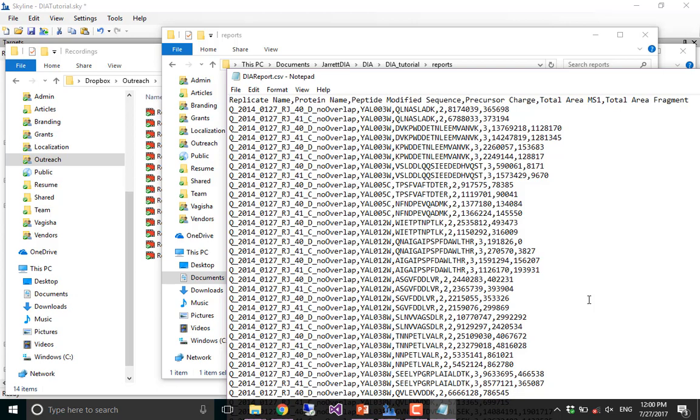Yeah, that's a good point. I've never run into that issue myself because generally I don't use Excel at that level. Another thing you could consider doing is filtering the report before you export it. You're familiar with the filtering stuff, yeah. So you could try to filter it a bit. Or just tell Microsoft that they need to make Excel work better with Skyline.